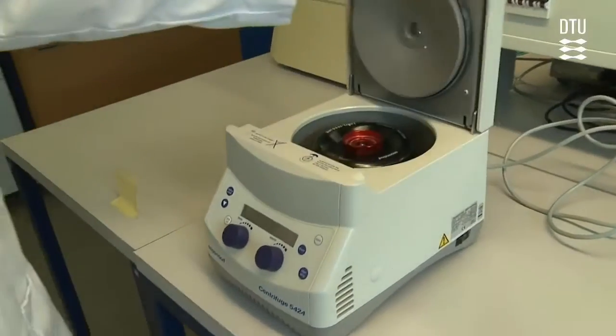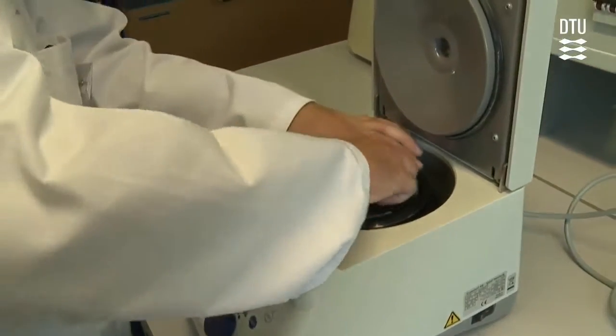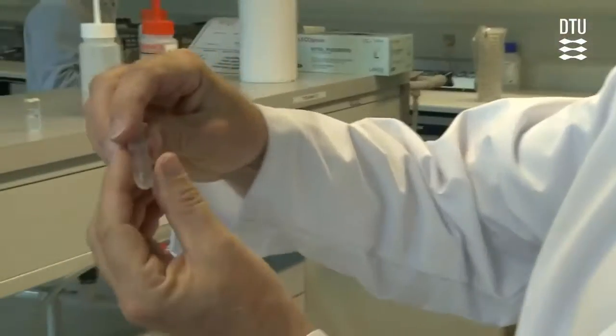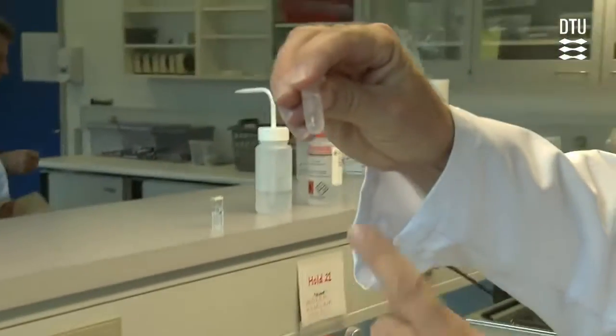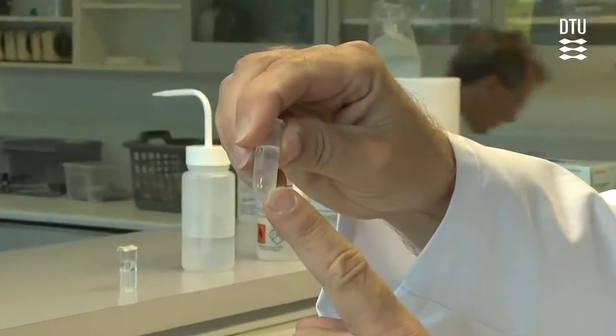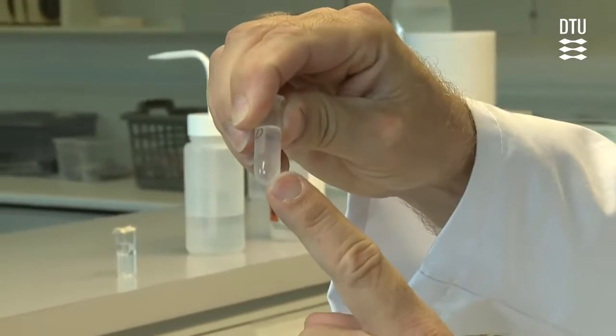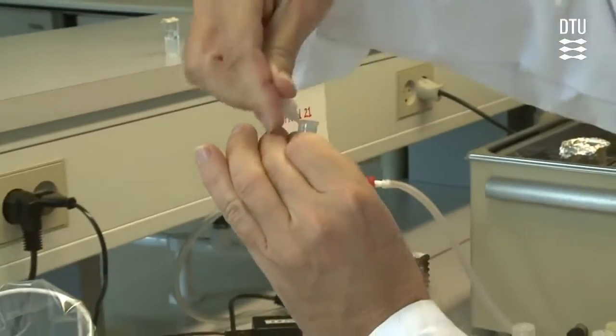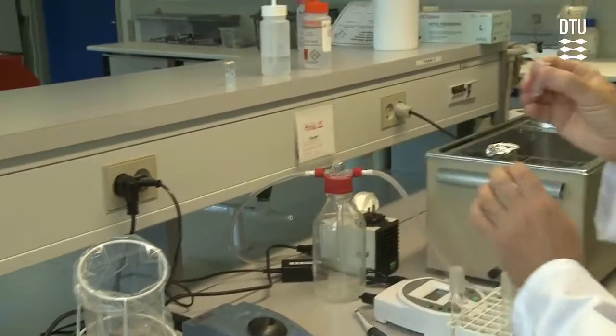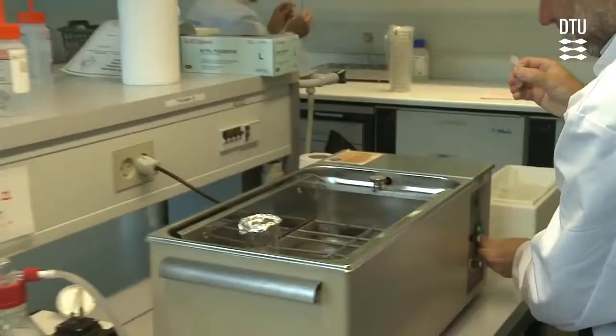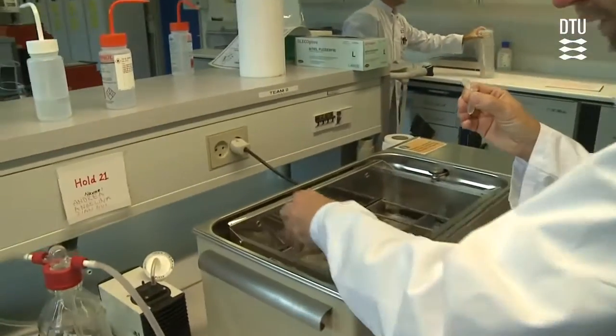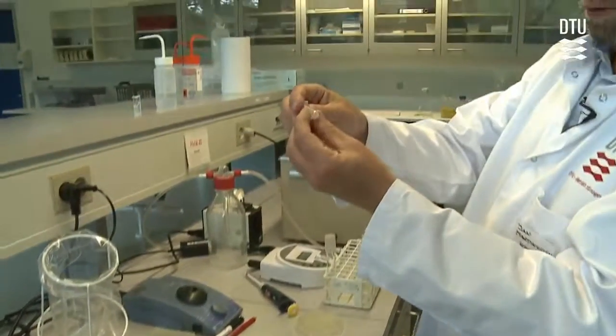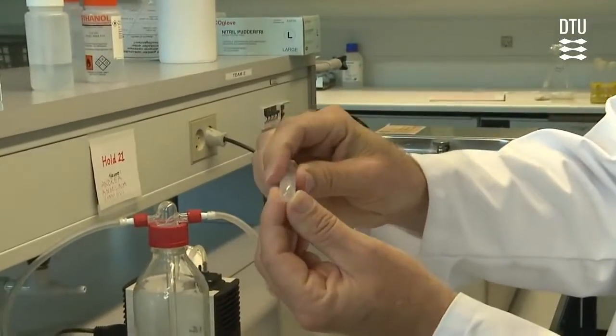After 2 minutes, the cells are spun down, and you'll see them, hopefully, at the bottom of the tube. You can see the pellet there. Then you can decant the medium into something, for instance the old culture flask, because you're not going to use the culture anymore.